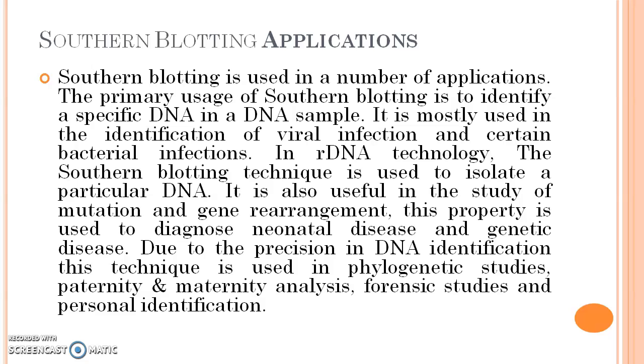Southern blotting applications. Southern blotting is used in a number of applications. The primary usage of Southern blotting is to identify a specific DNA in a DNA sample. It is mostly useful in the identification of viral infection and certain bacterial infections.